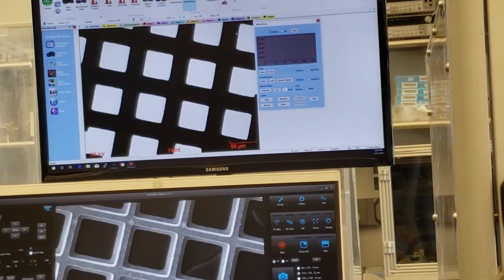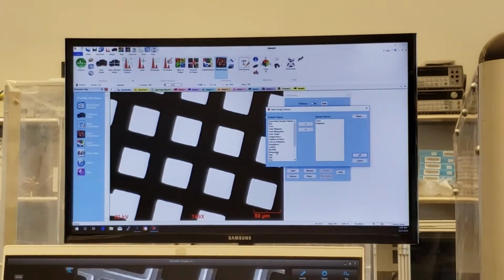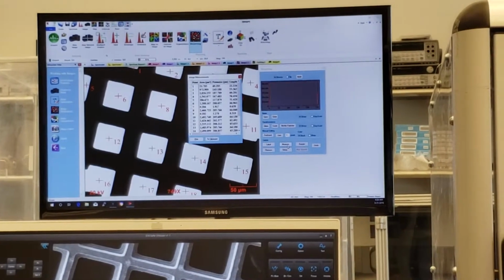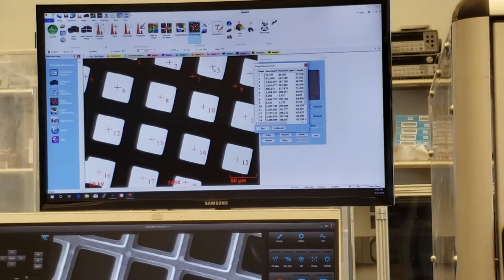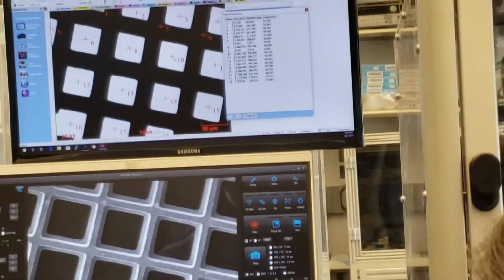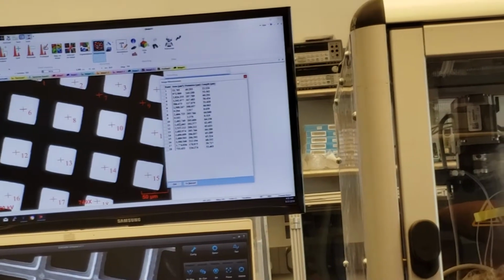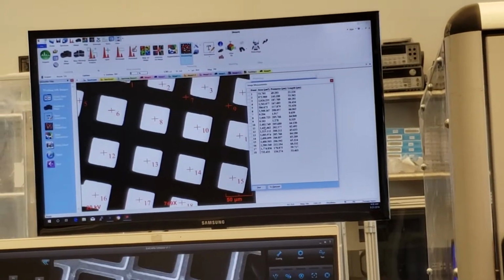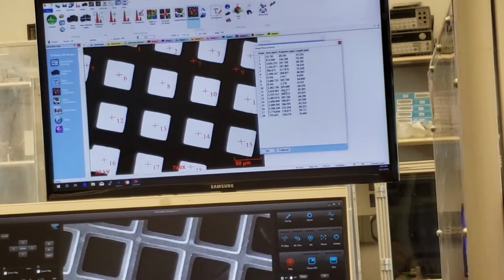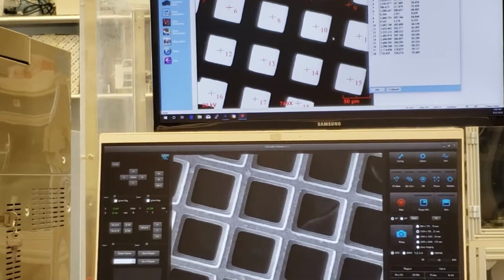All right, great. So now it just has white, right? So now if we said setup, and if we want to measure area, perimeter or even length, say okay, and then we just go measure. That's a lot easier for it to work with, right? Particle number 10, this particle that it thinks, what is that? 2,482 microns in area, and the perimeter is 205, and the length is 64. So it's measuring that. It thinks that square is a particle.